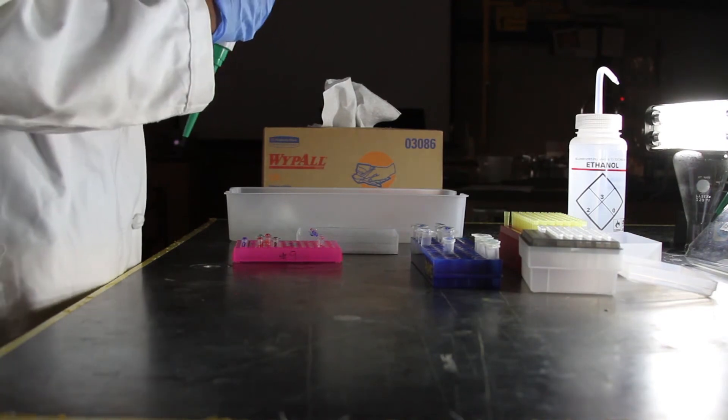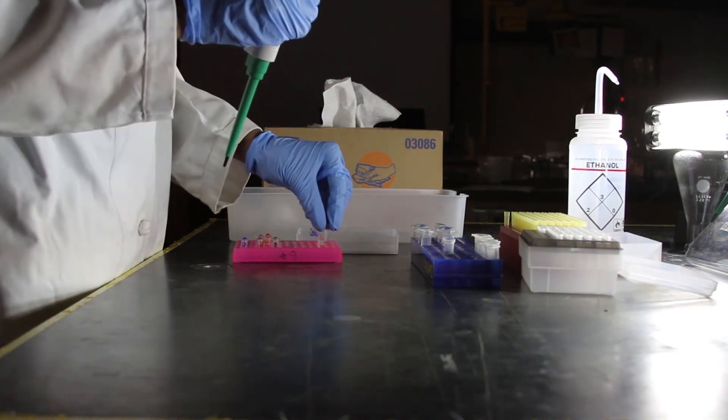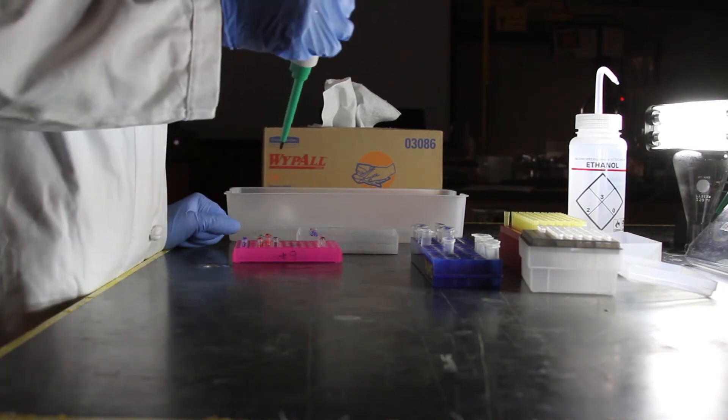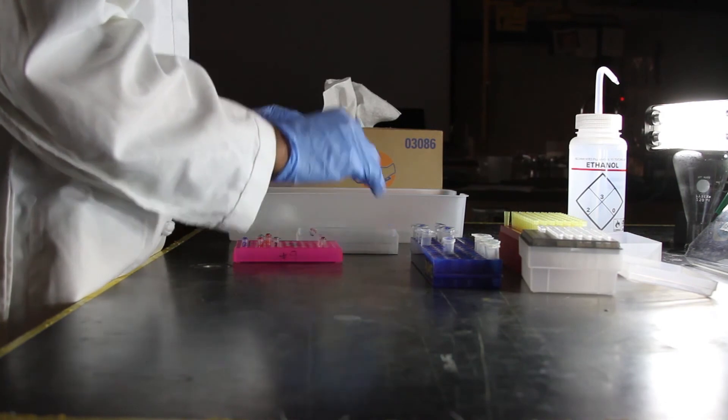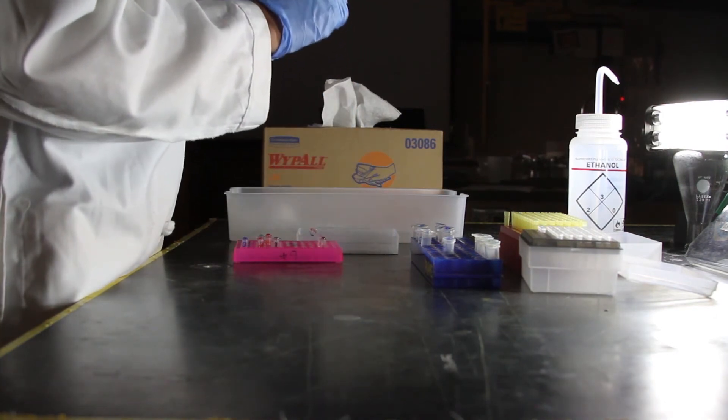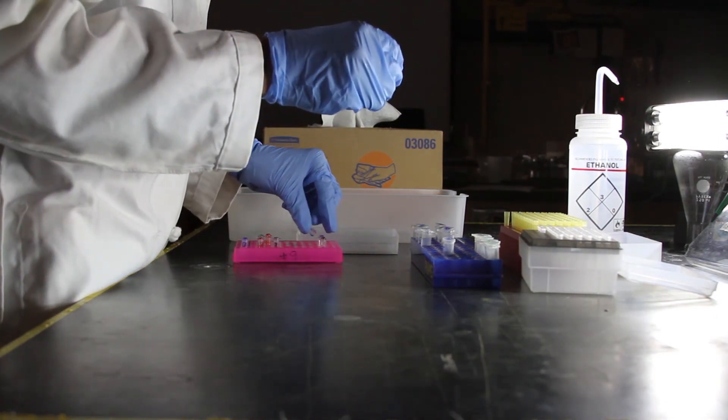Spin the samples for 5 seconds in a microcentrifuge or flick them to collect all of the mixtures to the bottom of the tube. Incubate the restriction digest at 37 degrees Celsius for 30 minutes, then 80 degrees Celsius for 20 minutes.